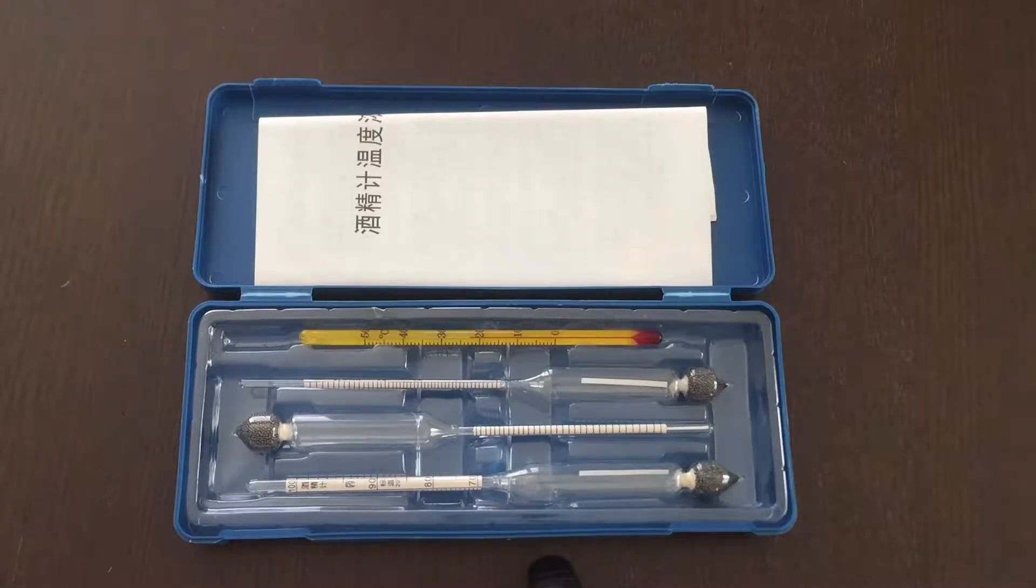This video is to hopefully review and show you kind of what you can buy if you buy the same product.